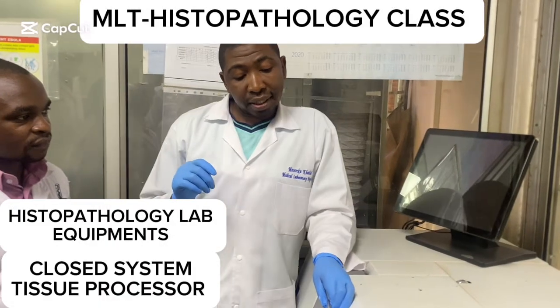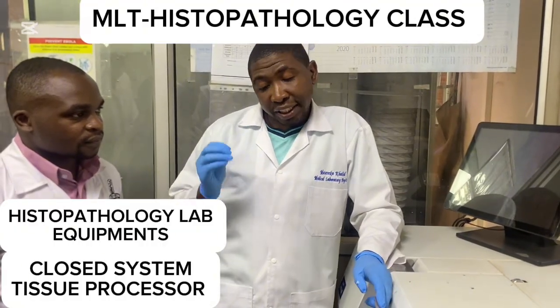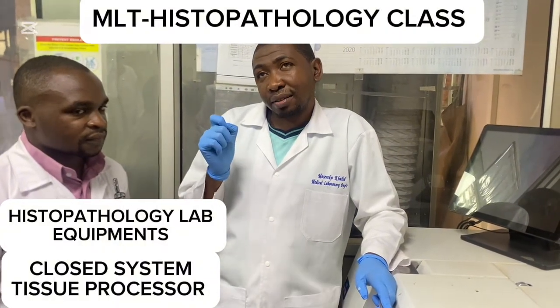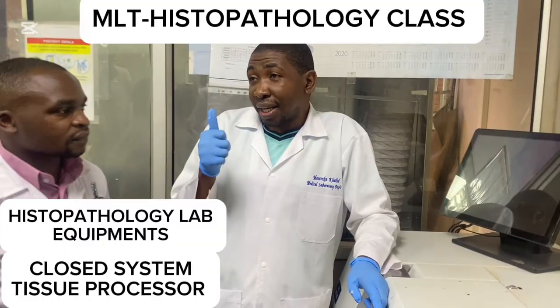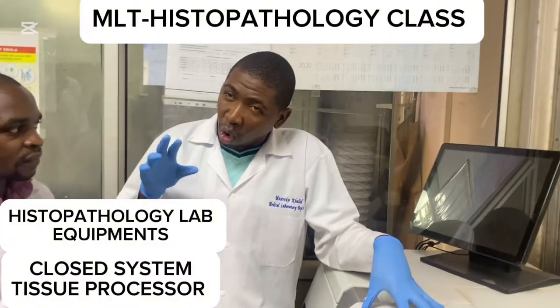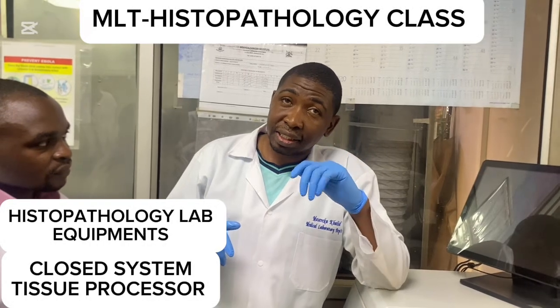Tissue processing is the process of removing water from tissue, so that tissue is infiltrated with an agent like paraffin wax, which makes it firm and provides it with support. Tissue processing can be achieved either by automation or by a manual system. By automation, we majorly have two types of tissue processors.